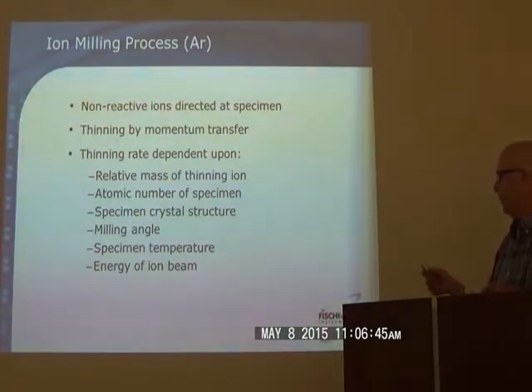And the process can be defined by taking non-reactive ions. We don't want to have ions that chemically react with the surface, hence we usually use argon, which doesn't chemically react with the ions on the surface.